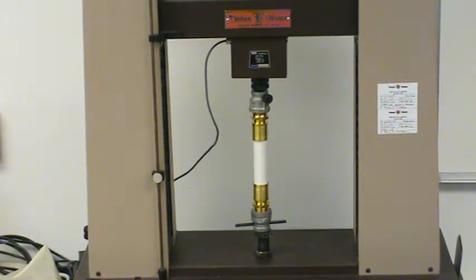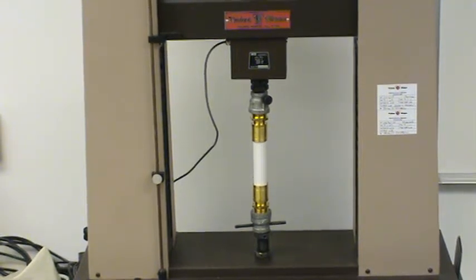This is a video of a tensile test of some 1-inch Raupex white UV shield pipe at the Rehau Laboratory in Leesburg, Virginia.